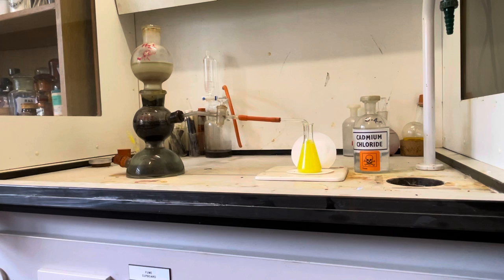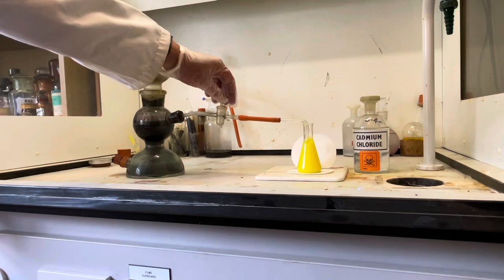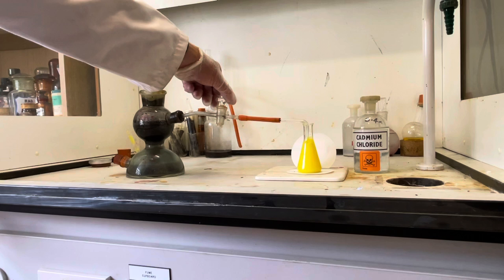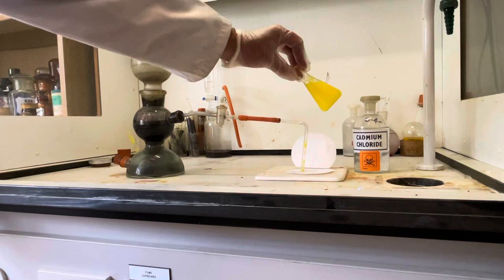We can filter that precipitate, and believe it or not I can actually mix it with linseed oil and make a pigment for oil painting — though it's something you don't want near your mouth. We'll bubble a little more, a bit faster. You can see there that a precipitate of cadmium sulphide is beginning to settle down already.